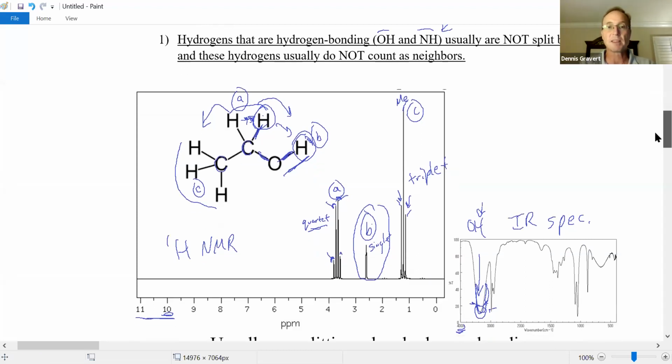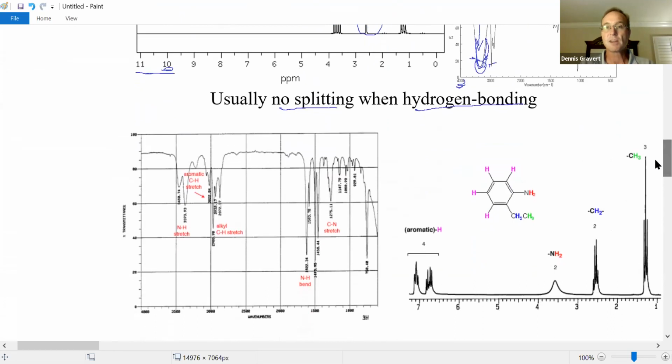So I found an example of that. I also found the IR. So the IR has got this crazy grid on it. It looks a little different than what we're accustomed to, but if you look down the x-axis, it says wave numbers, which are units for the infrared spectrum. Over here is kind of blurred, but it's 4,000, increasing to the left. Yep, this is an infrared spectrum.